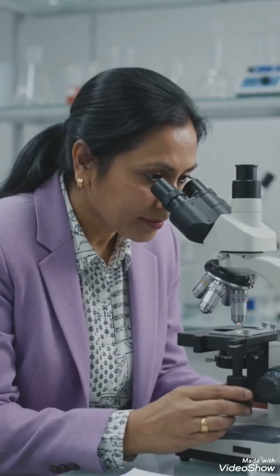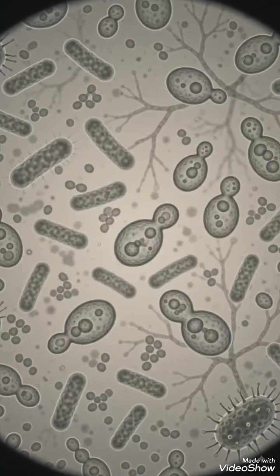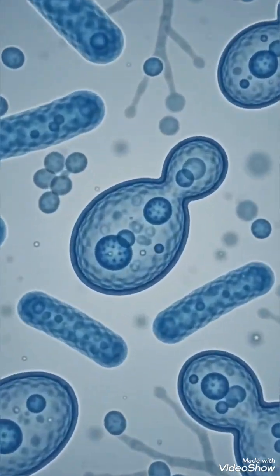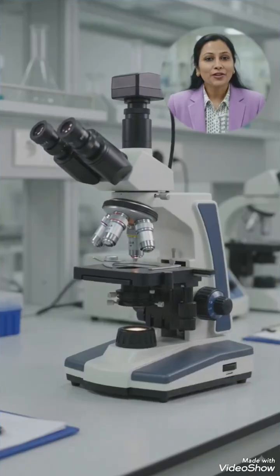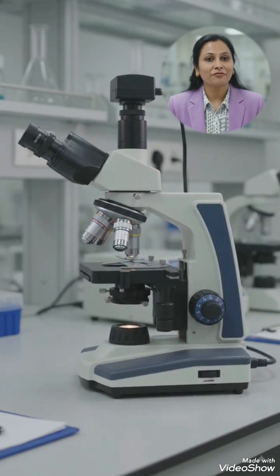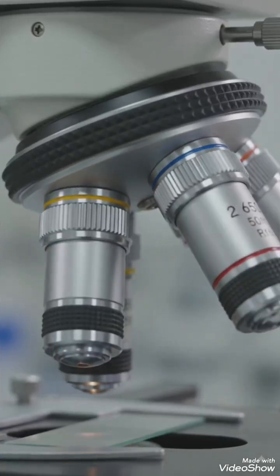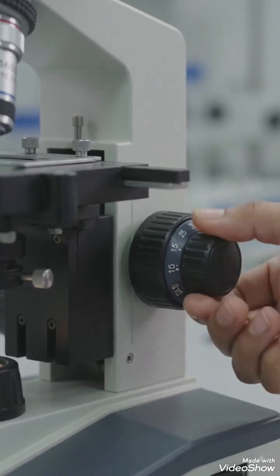Microorganisms are too small to be seen with naked eyes. To study their shape, size, arrangement, and internal structures, scientists use a microscope and various staining techniques. A microscope is an optical instrument used to magnify very small objects that cannot be seen by naked eyes. It enlarges microorganisms and allows detailed observation of their morphology and cellular structures.